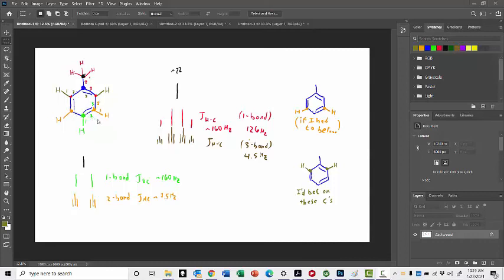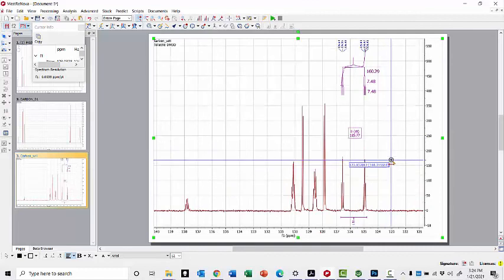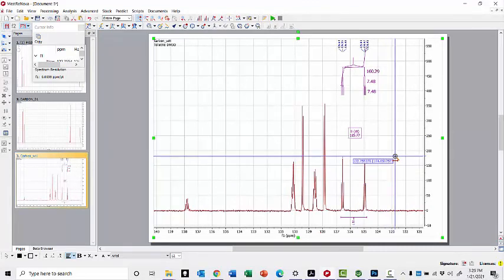But one of the reasons why we generally turn off the multiplicity information in C13 NMR is because of the way in which the 1, 2, and 3-bond couplings end up being much messier than you'd expect. And for all that proton NMR looks bad, it's actually much more regular, follows rules more precisely. So generally speaking, ignore the multiplicity in C13 NMR and focus more on the multiplicity in proton NMR, because generally we will turn off the multiplicity information in C13 NMR. So my main point here is that coupling is complicated, and trying to understand it does offer some value, but you also need to be careful with multiplicity, because even a relatively simple and straightforward molecule like toluene has within it some complexities.